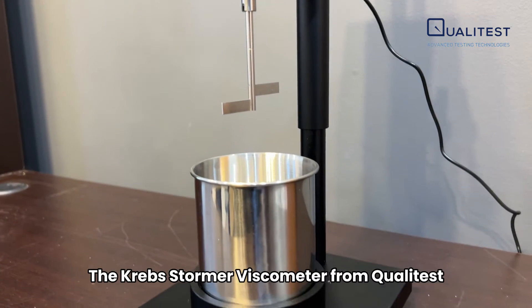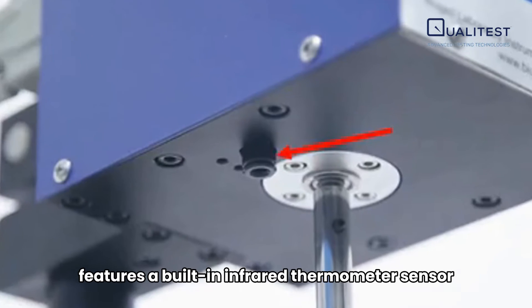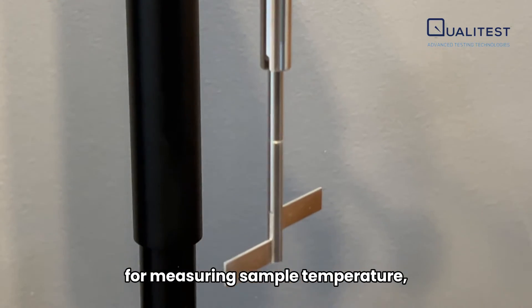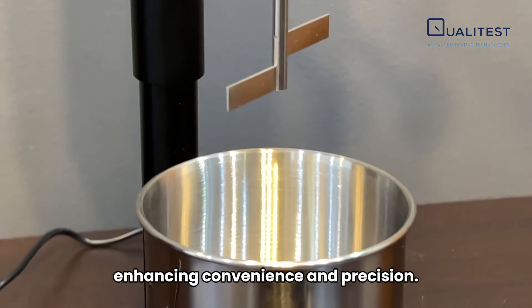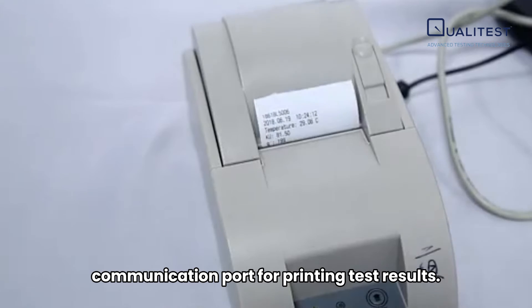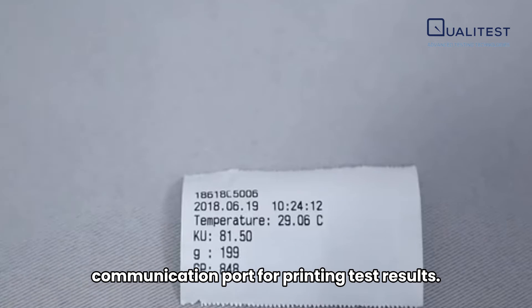The Krebs Stormer Viscometer from Qualitest features a built-in infrared thermometer sensor for measuring sample temperature, enhancing convenience and precision. Additionally, this instrument supports an RS-232 communication port for printing test results.